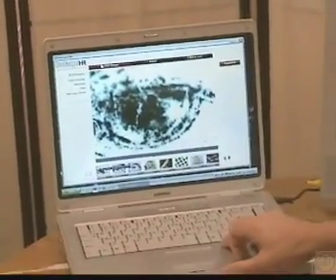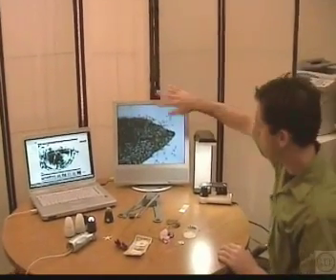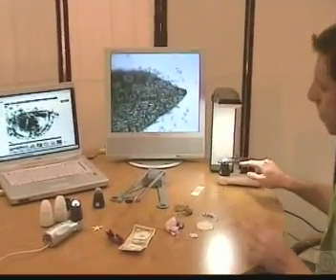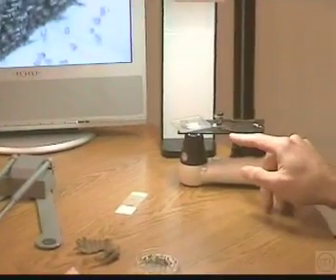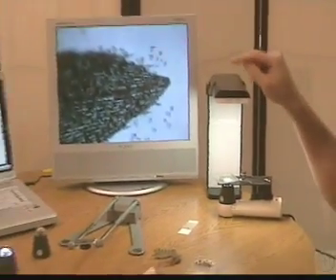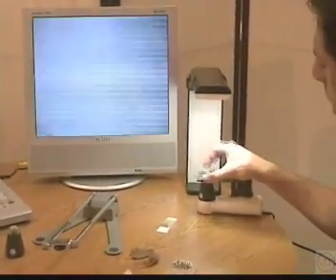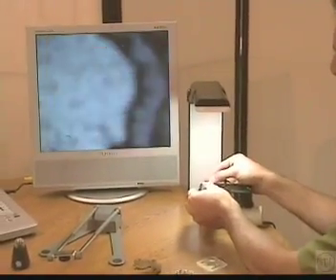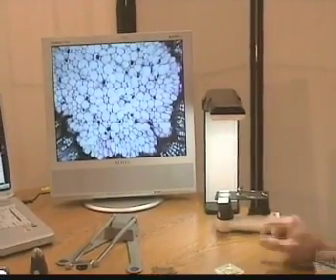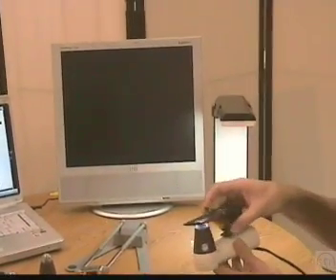I'm going to set the ProScope aside now and we're going to look at the Scope on a Rope L2. This is the analog model for a television set — it plugs directly into the input on a TV set. I have this set up in the third mode: the stage and view. The stage allows you to view prepared slides and water samples. This is some microorganisms in pond water at the tip of an elodea leaf. I'll put on a regular prepared slide — this is the cross section of a carrot root at 200x, so we're magnifying 200 times.